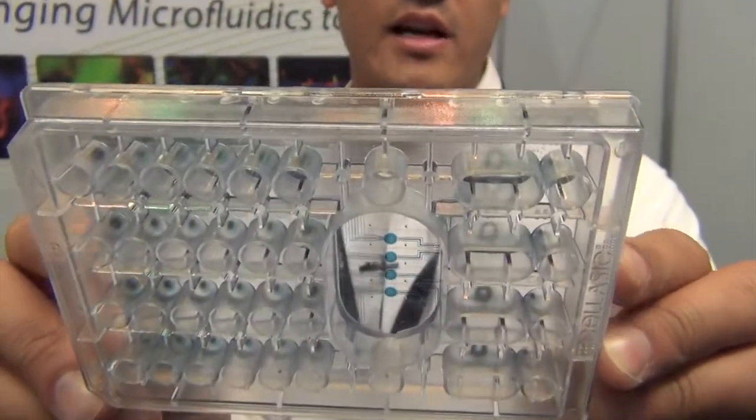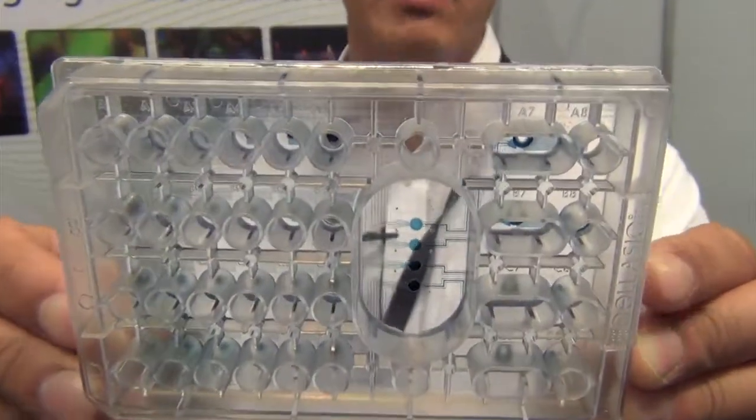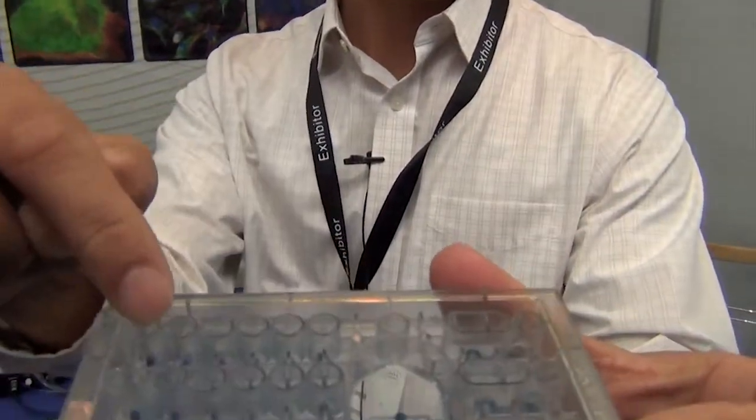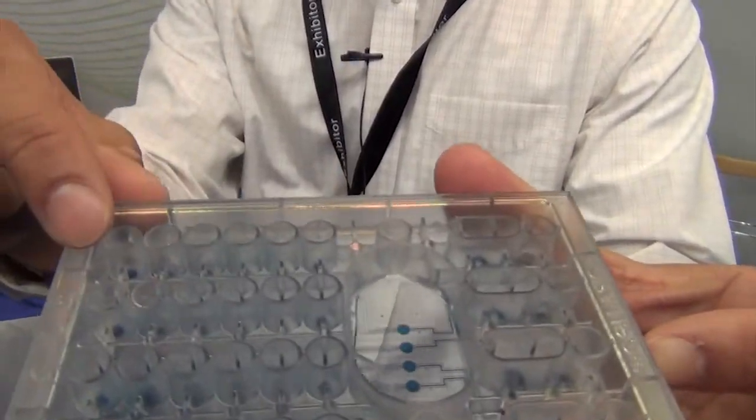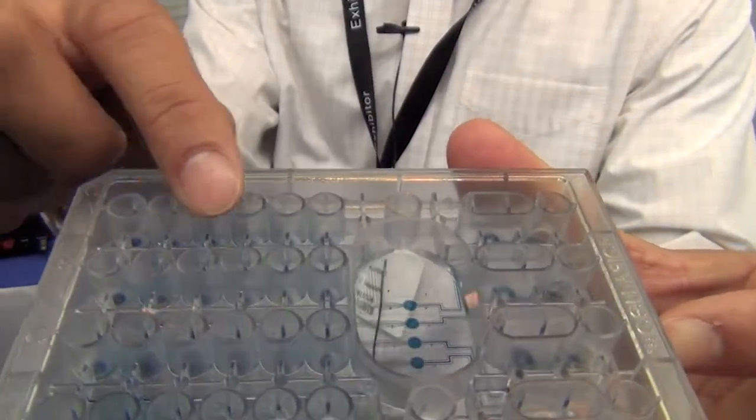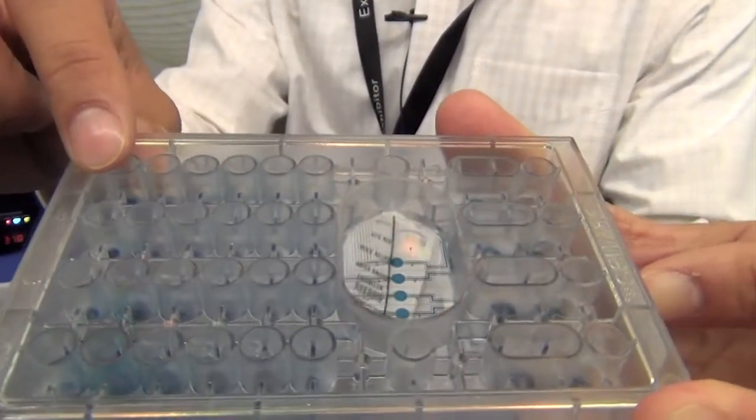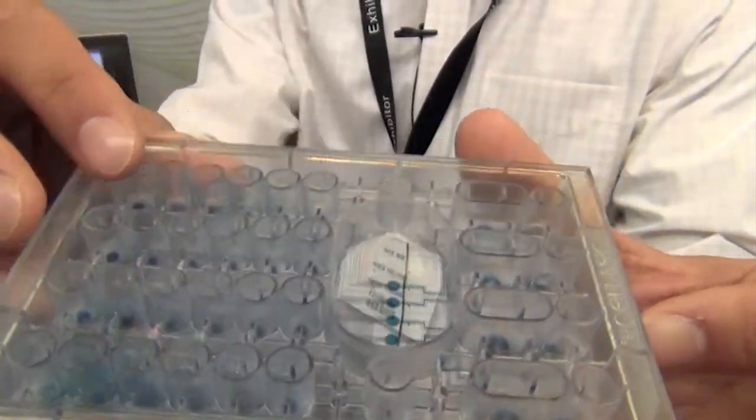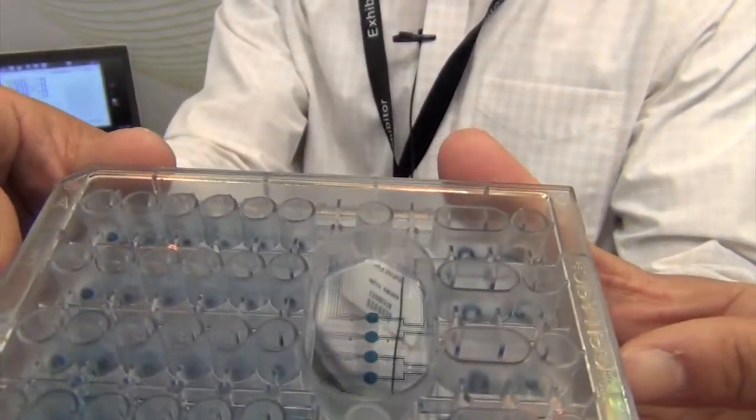And so what we have here is one of our designs called the n04s microfluidic plate. It's a fluidic system that allows you to essentially pipette various different conditions such as reagents, drugs - you have up to six different conditions - and you put your cells in here as well and they get loaded via micro channels into a micro chamber. And you can see that in the middle there.